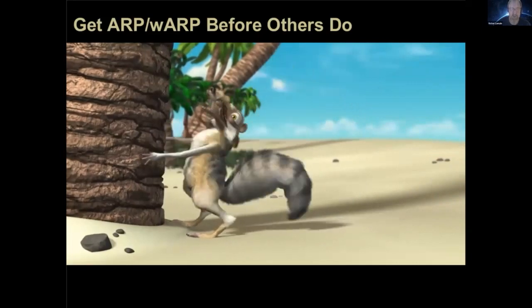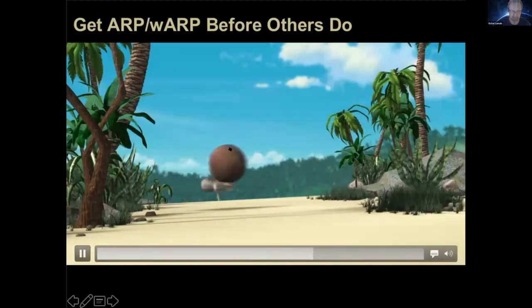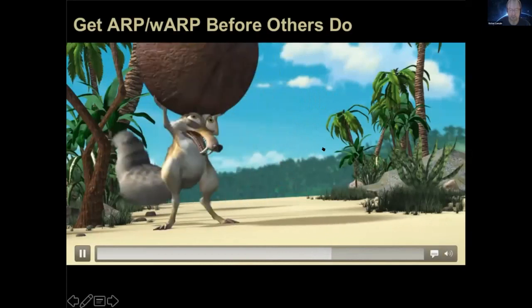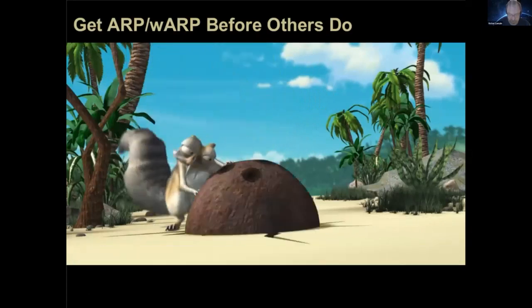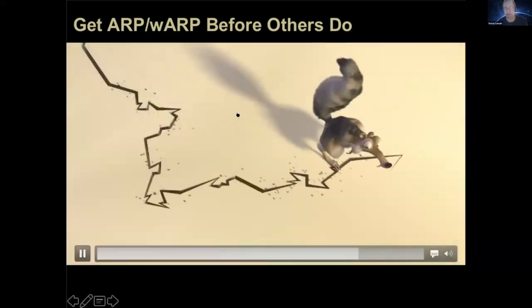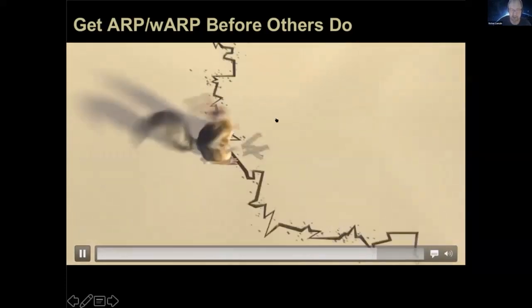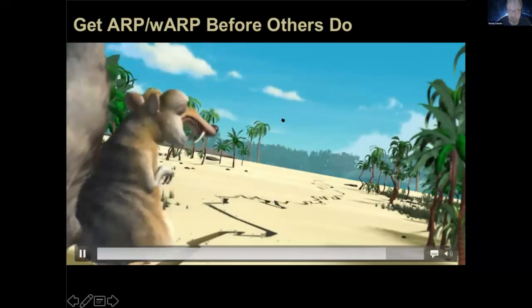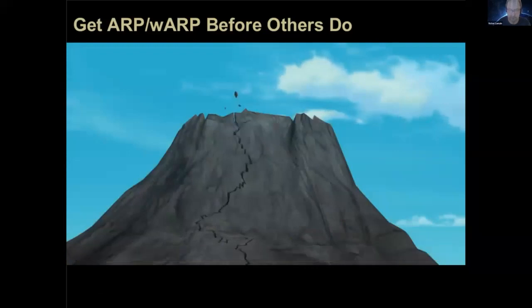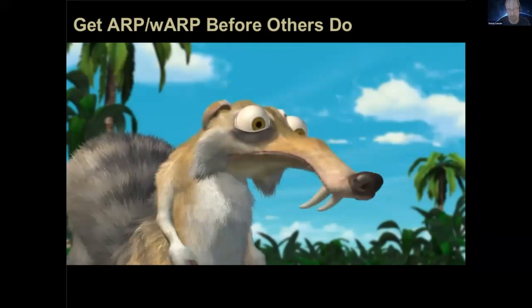Consulting a supervisor is the very best idea, and here is the way to proceed. Use ARP wARP. So this is ARP wARP, and you launch it. You launch it just like that. Yes, like that, and it starts tracing the chain. You don't have to interfere with that. It will trace until the end of the structure, or at least whatever could be traced in an automated way. And yeah, finish it at some stage. And what you have at the end is a very happy crystallographer.